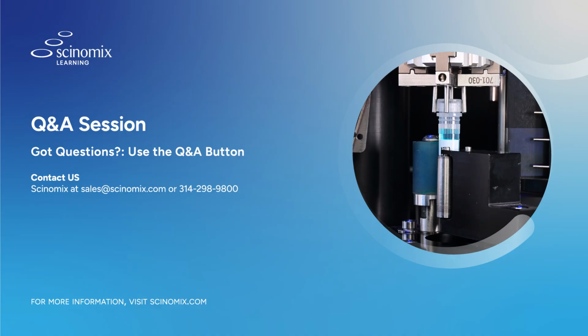But you can certainly only use the aliquoting side of the device. I've seen that before where some workflows are doing plate dispensing without labeling, but another lab across the way is dispensing into tubes. They're mixing and matching which modules they're using, and you could absolutely do that. But do understand too, the aliquotter is going to be that single channel pipette and the labeler forming one unit.